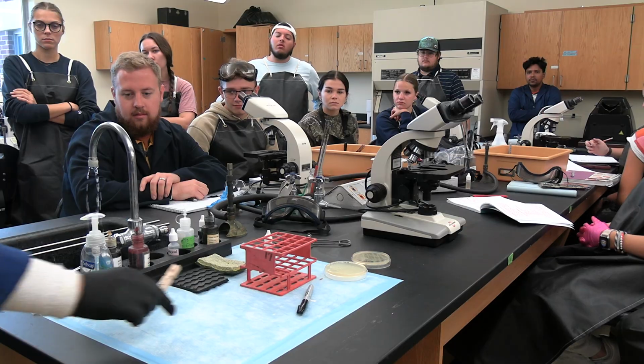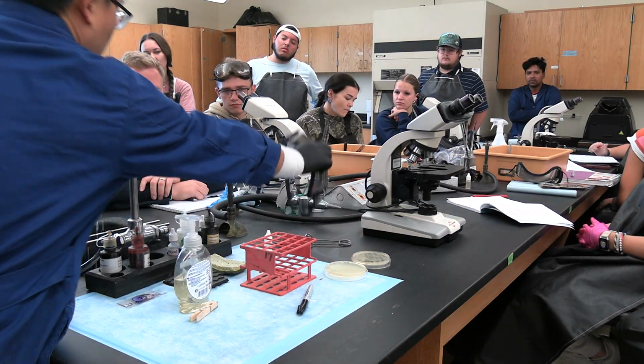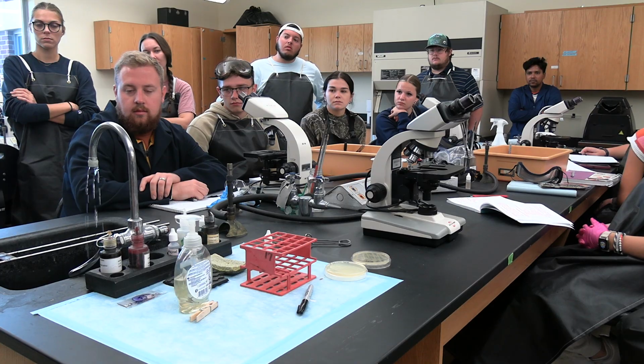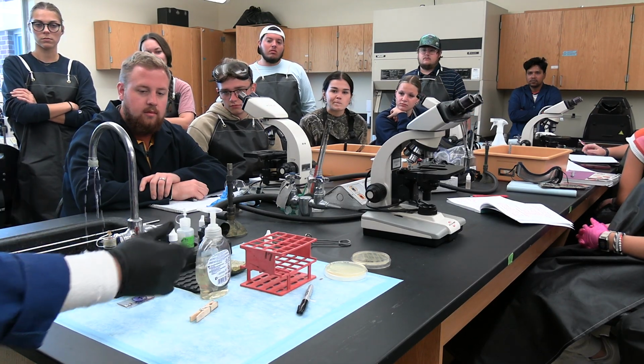Now we're going to move on to the major step of the gram stain. We're going to wear goggles. Make sure the goggles completely cover your eyes. Then make sure our gram stain reagents are ready.